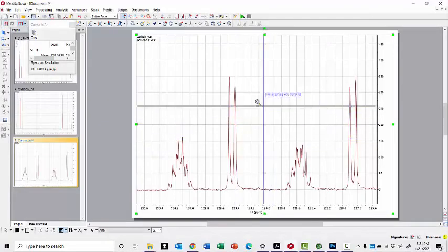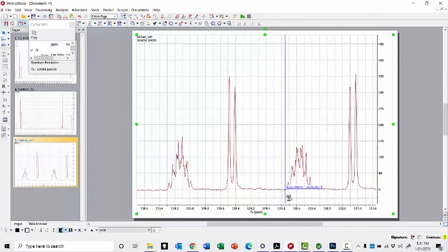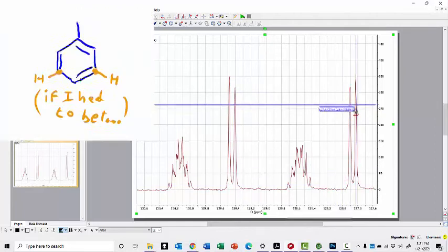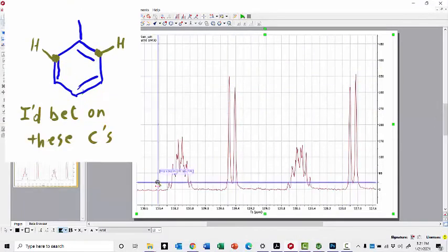Finally, of course, I need to draw your attention to the 2 remaining doublets, and there's this horrible looking thing right here that nevertheless has a rough sextet sort of appearance. It's more complicated than that, but it kind of looks like a sextet. And then, of course, we have the relatively nice doublets here. So this is a wide doublet with a narrow doublet within. This is a wide doublet with a narrow sextet plus something more complicated than that going on.